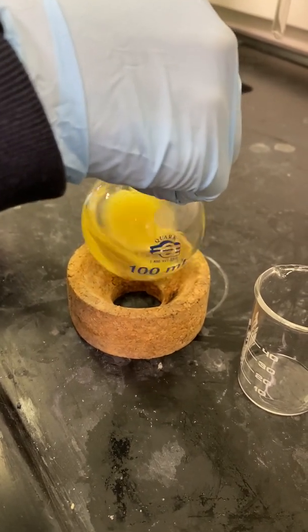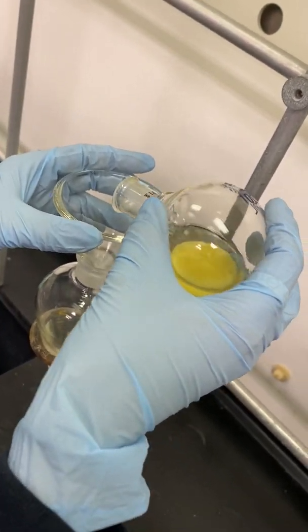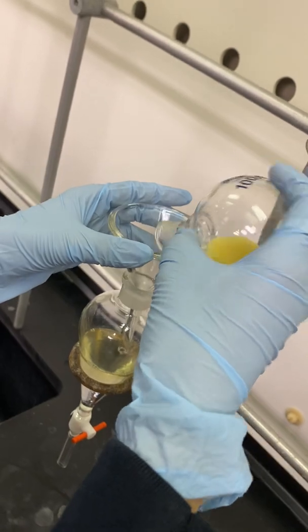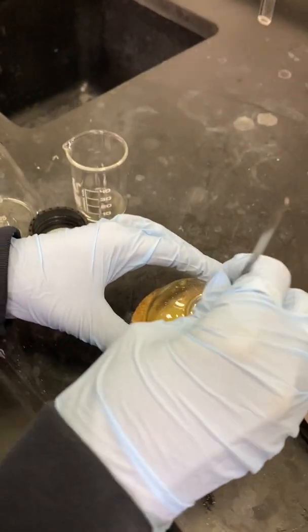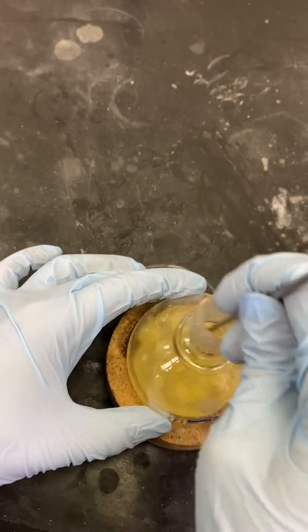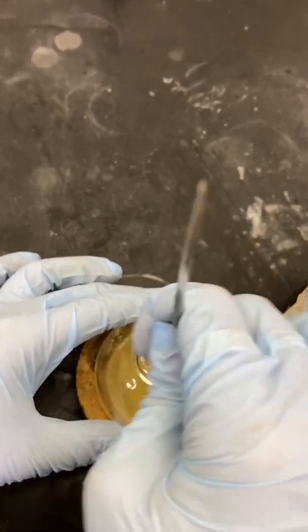You might have to do this several times to get all of your product to dissolve. I am now starting to pour more of my dissolved product into the separatory funnel. I still have more solids in my round bottom flask so I will have to add more ethyl acetate. I am now using a spatula to try and break up the clumps of solid product so it dissolves better in the ethyl acetate. If there are solids in your separatory funnel, it will be hard to work up the reaction.